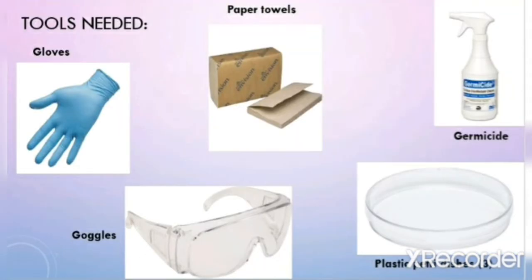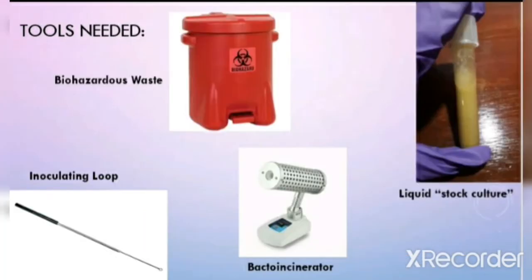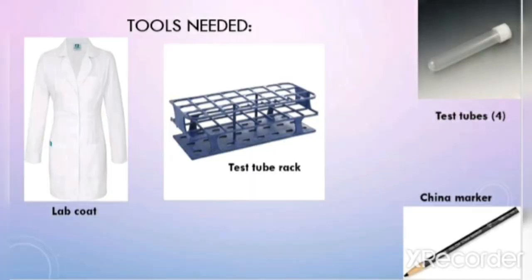After you've cleaned up your workspace, gather up all the materials that you will need for this experiment. You will need gloves, paper towels, germicide, goggles, plastic petri dishes — you will need three of them — a biohazardous waste container, an inoculating loop, a Bunsen burner incinerator, your liquid stock culture, a lab coat, a test tube rack, four test tubes, and a china marker.